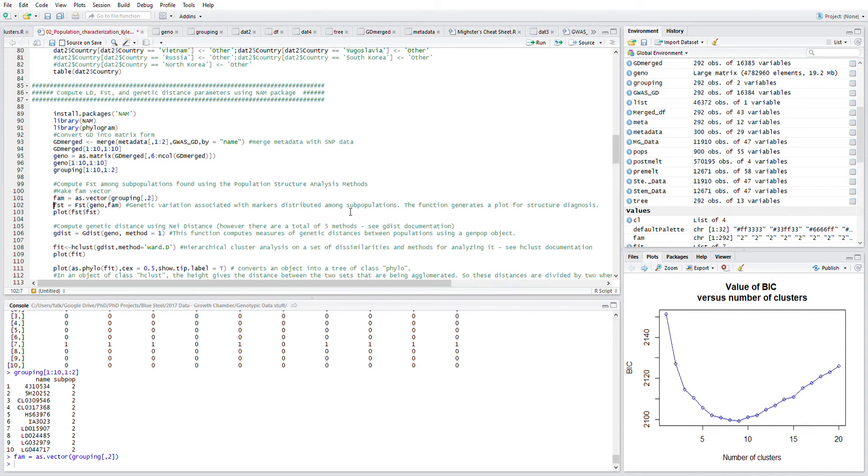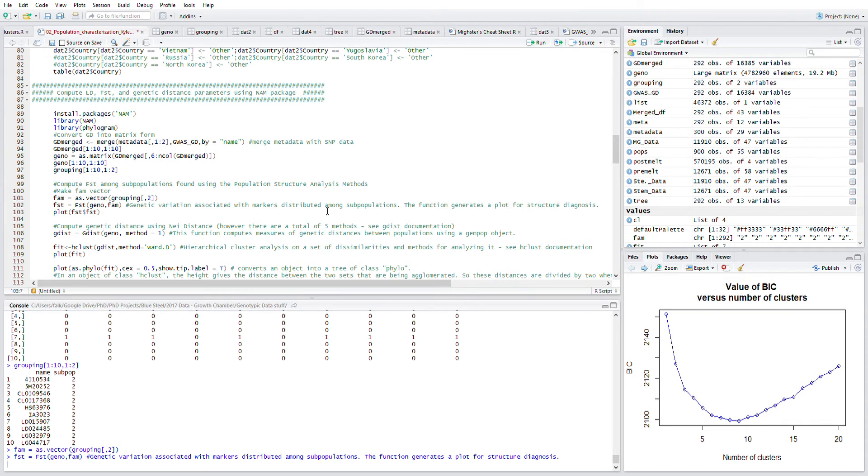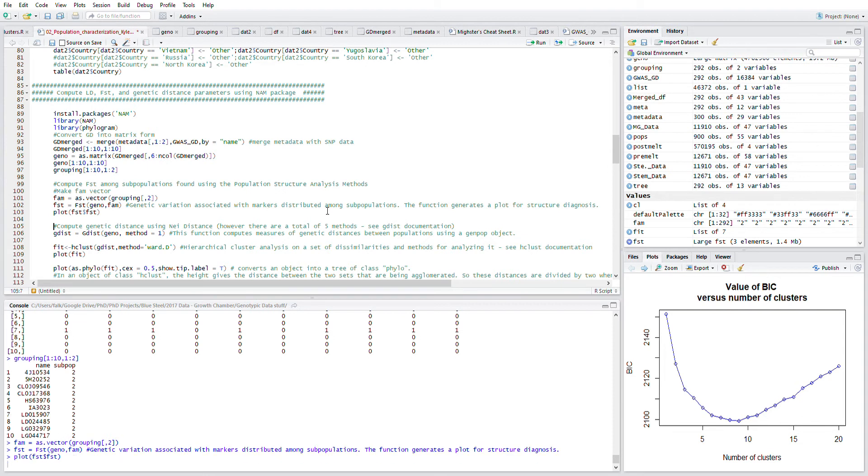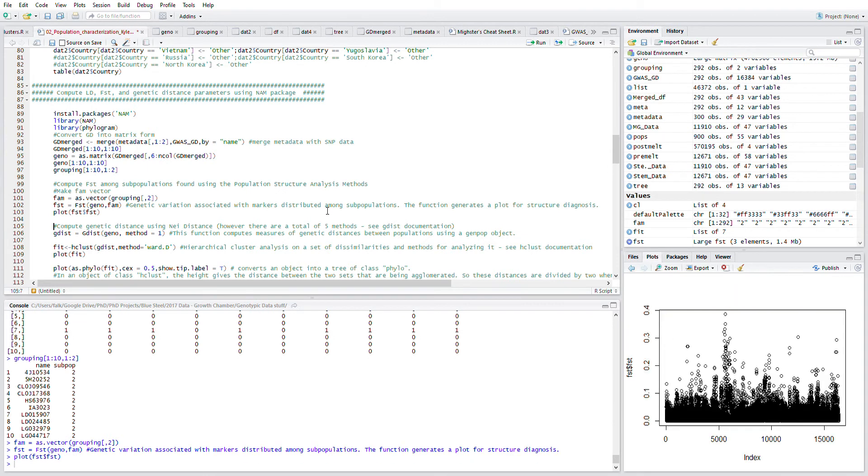The function generates a plot for structure diagnosis. It will take a little bit to create that plot in which it hems together the genotypic information as well as the family information, as we're calling it here. We can look at that and look at where the variation across the genome is of all the SNP data.